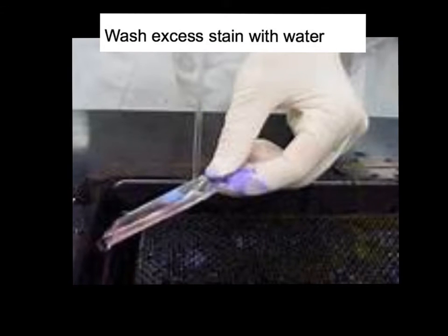Here we are with that last step where we're rinsing off that counterstain of safranin. Again, we are doing that above our bacterial culture, so we're letting our stain drain down. We blot dry it.